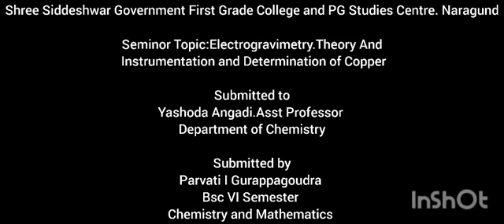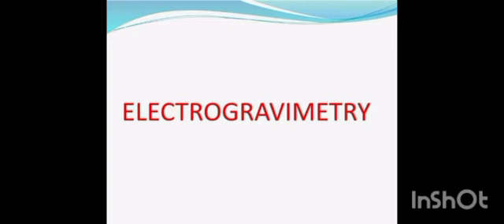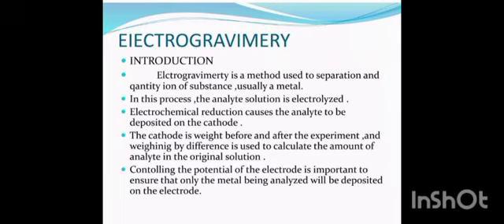Today we discussed the topic of electrogravimetry: theory, instrumentation, and determination of copper by using the electrogravimetry method. Electrogravimetry is a method. Here is some introduction to this electrogravimetry method.